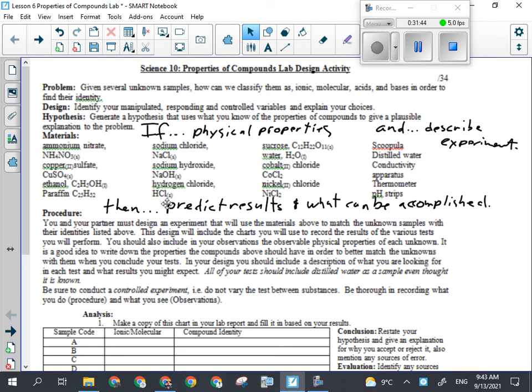Okay, all right, so now I've done that. I've dissolved some salt in there, and I didn't dissolve very much salt. It's saying only a conductivity of 5. Okay, 6. I stir a little more, I might get 7. But this will be a lot more conductive for you guys because you'll have a lot more salt in there. Okay, 2 more. Everybody follow? All right, so that's all you have to watch for.